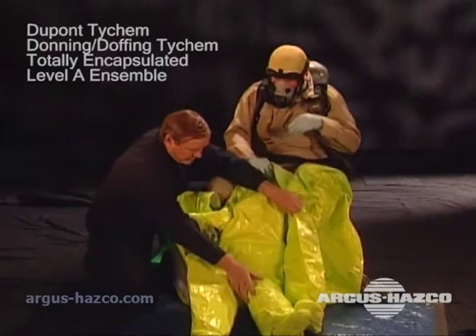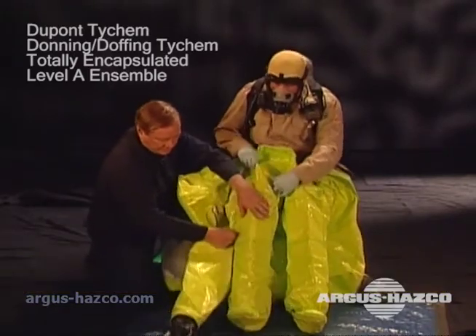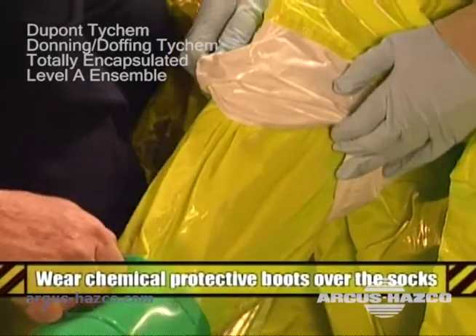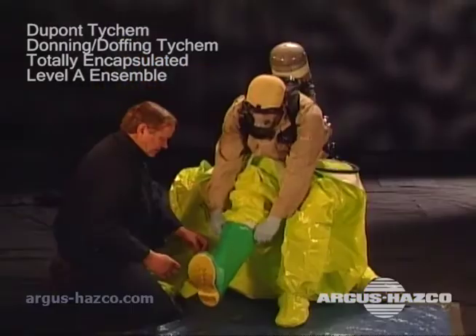This suit comes with attached socks. You do not wear shoes inside these socks. Do not walk around in these socks on abrasive surfaces or on any chemicals. Always wear chemical protective boots over these socks. The boots must be large enough to accommodate the socks, so you'll likely need a larger size than you normally wear.